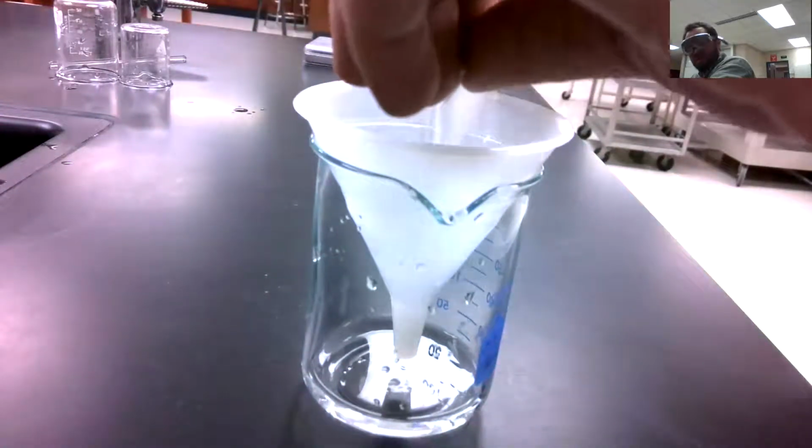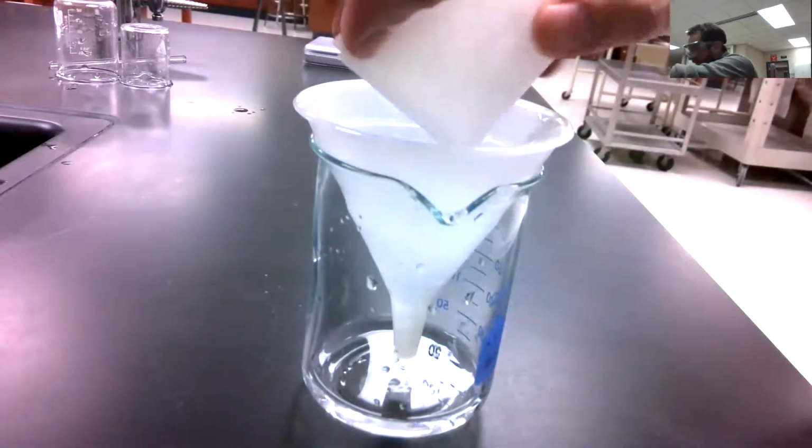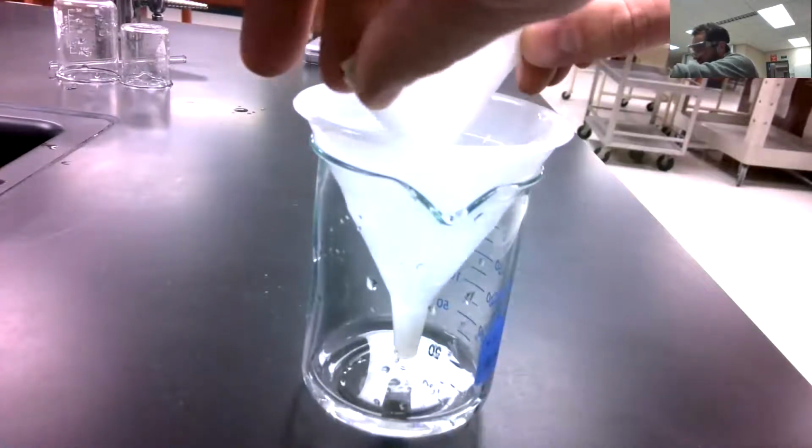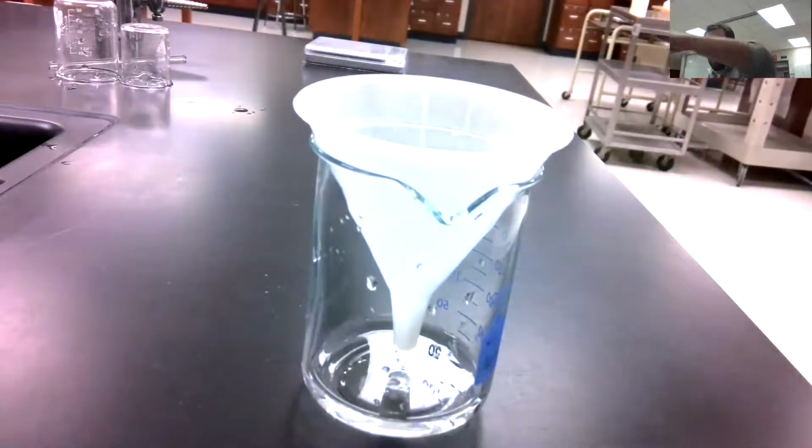Very wet as I pull this out. I'll close it up again, since it's kind of back to being flat. I don't want any of that solid to fall out of it. I'm just going to set this over there on the side and flip it over real quick so that my name is there, so we know who we're looking for when we come back on Monday.